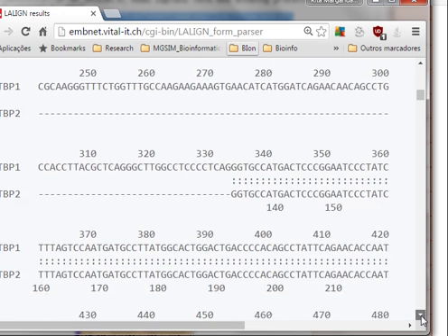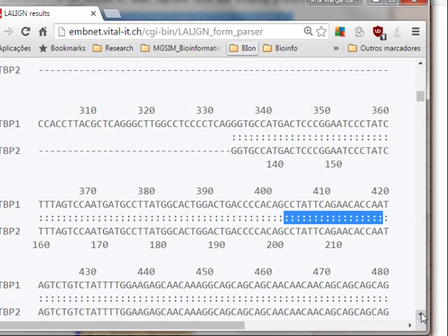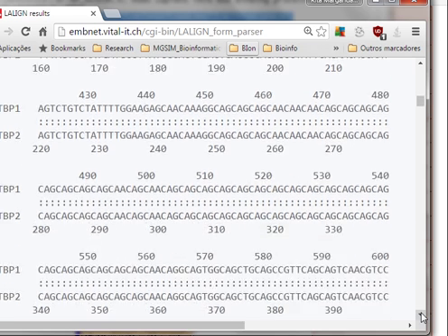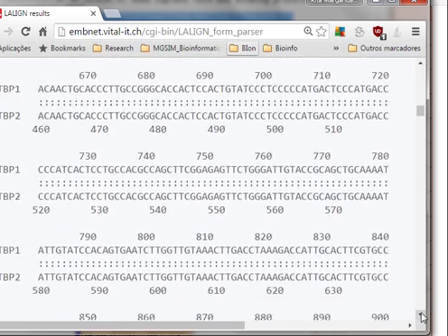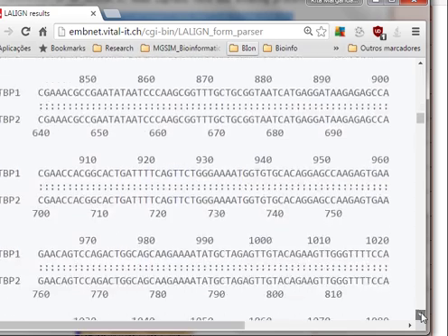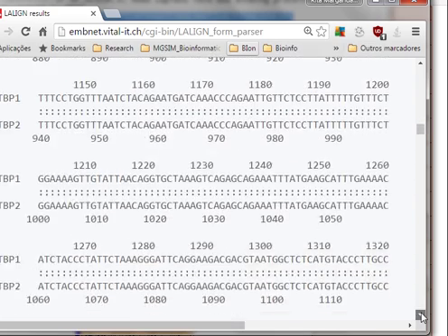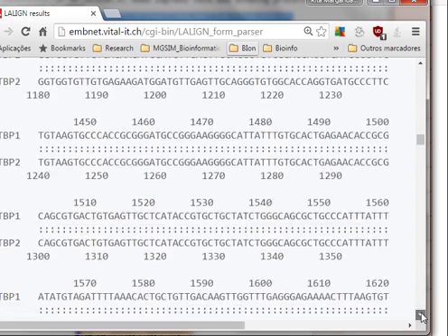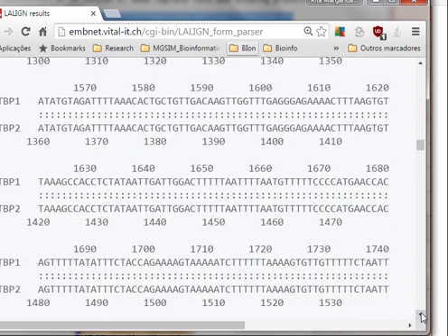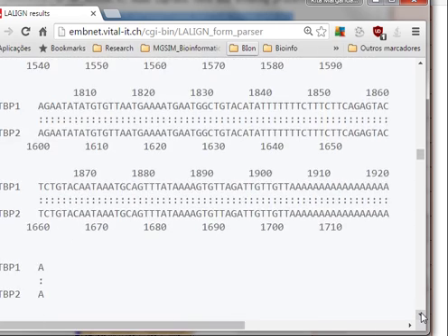Then you have once again perfectly identical sequence, so it's the 89.5% identity that you have in here until the end of the sequences. And if you ask for more than one alignment, you will get the 3 proposals. Now you're watching the first and best alignment proposal.